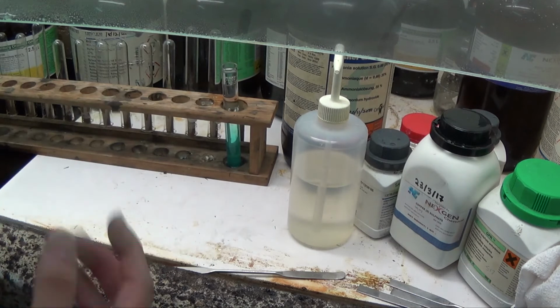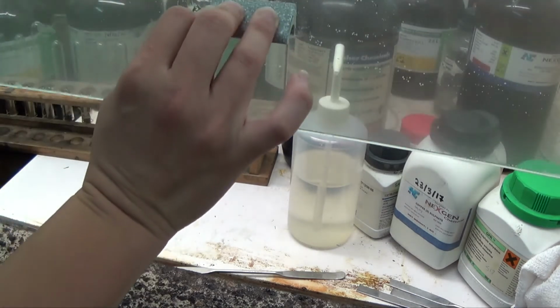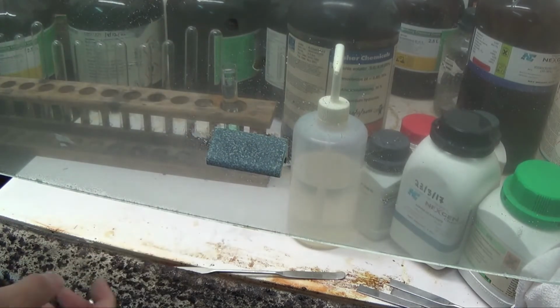The smell of NO2 still lingers around. It's really a toxic gas, so I should clean this up and move away and come back to this later on.